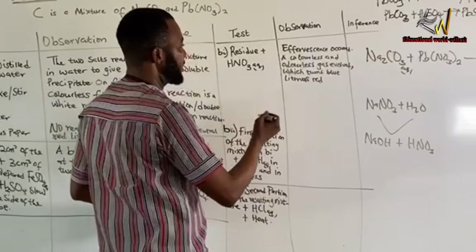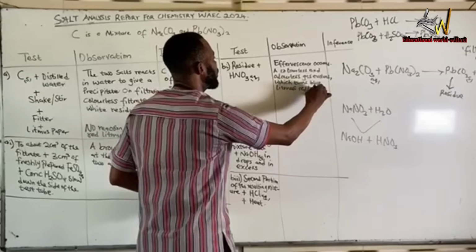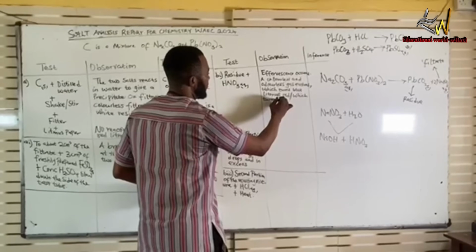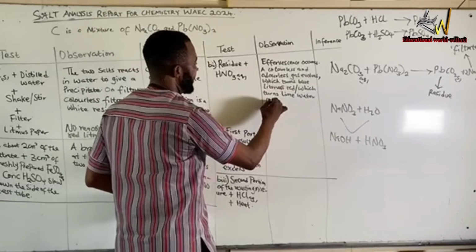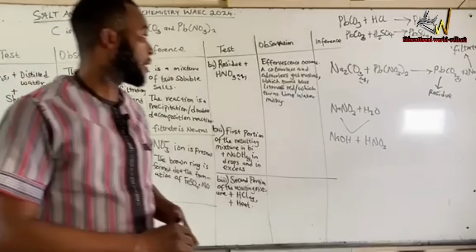Another way to confirm the gas is, or you say which turns lime water milky. These are our reports, and we've done the lime water test.